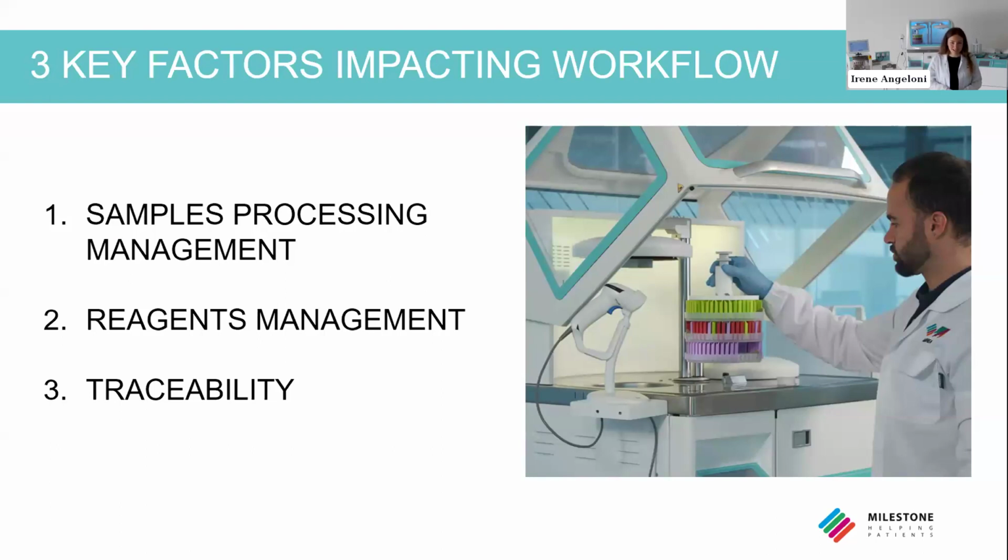To conclude, let's see once more the 3 key factors where we have room for action to improve the laboratory workflow. The management of the samples, with the implementation of the lean workflow with the processing of some samples during the day, and also by introducing automation with the auto-embedding system, automation that we find also with the tracking line to automatically track the cassette.